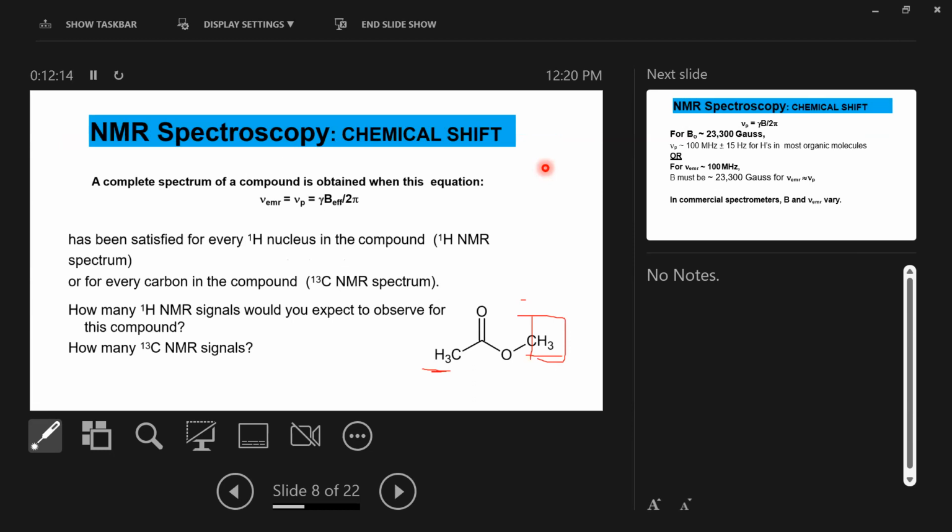I'm asking you if these protons, which one you'd expect them to be in a different environment? You guys have told me they all agree that it's in different environments, and I asked you why. You said to me that the oxygen is more electronegative than the carbon, and I said yes. So I'm not really sure. You just said a while ago, you just say yes.